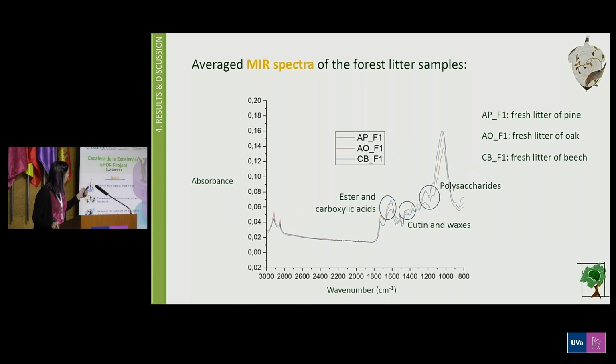These 3 points are here in the circles. In this wave number, this signal is related with ester and carboxylic acids.